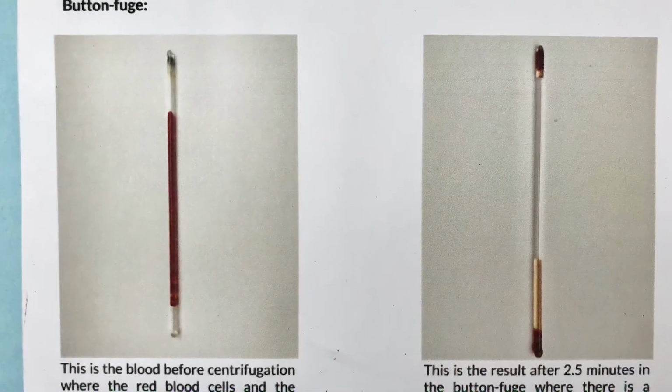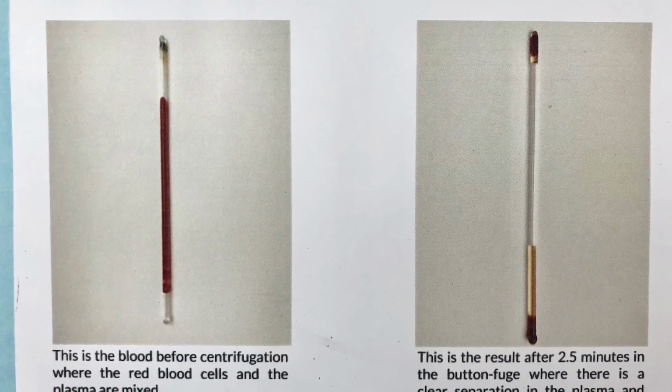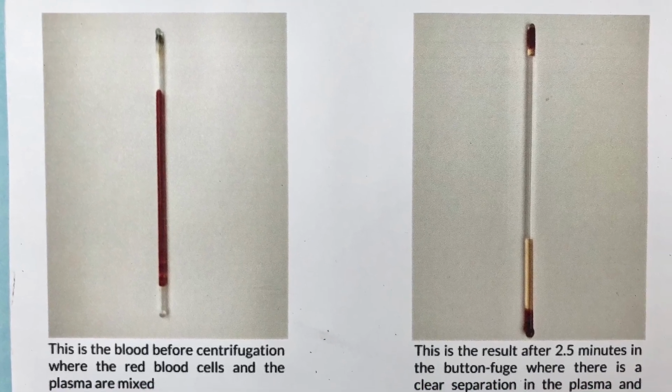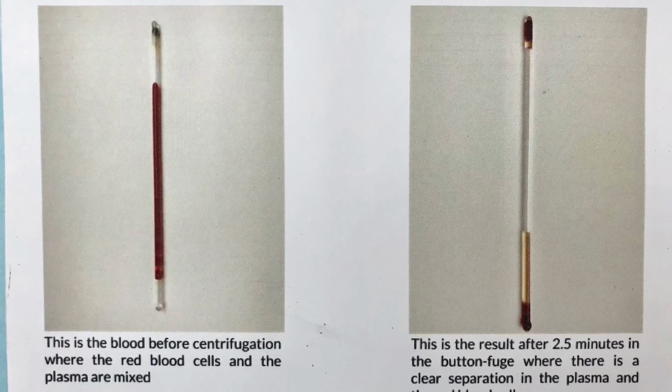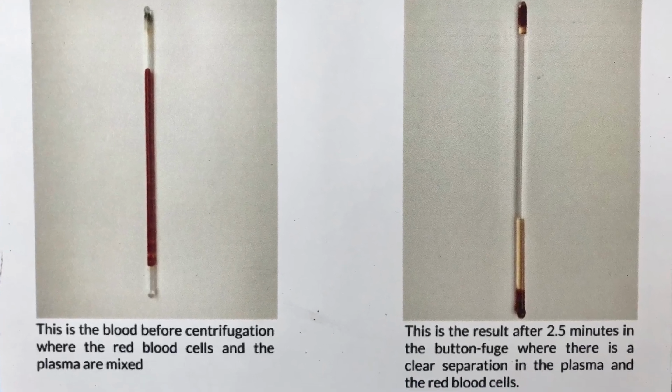These were the results for the buttonfuge. The first image is the blood before centrifugation, where the red blood cells and the plasma are mixed. The second image is the result after 2.5 minutes in the buttonfuge, where there is a clear separation in the plasma and the red blood cells.